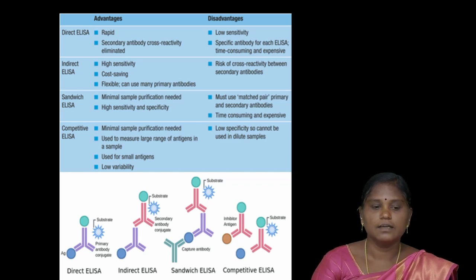First we will see the advantages. In the direct ELISA, the advantage is speed, and the secondary antibody cross reactivity is eliminated.